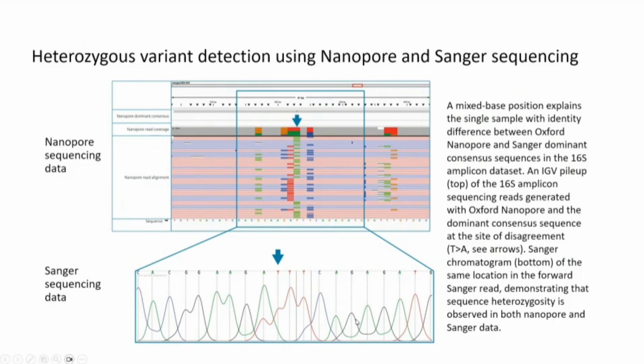Normally, good data, with good bases called in the Sanger sequencing data, should have very sharp peaks. The one we are seeing right now is a bit noisy, so sometimes it is hard to determine the sequence based on Sanger sequencing data such as this one.